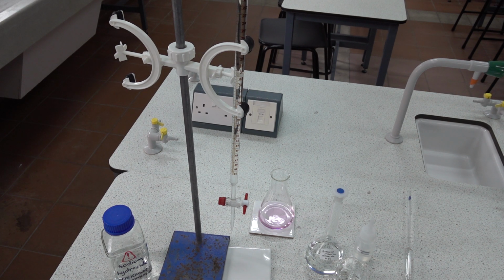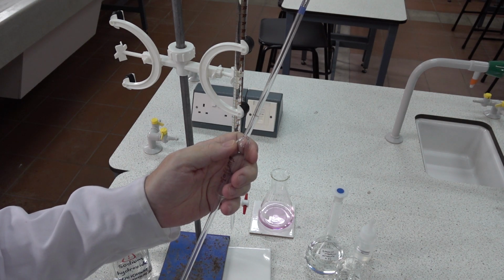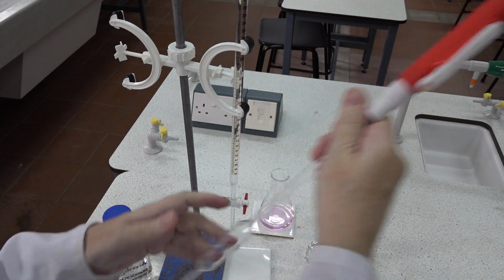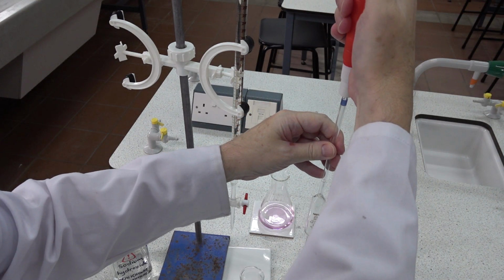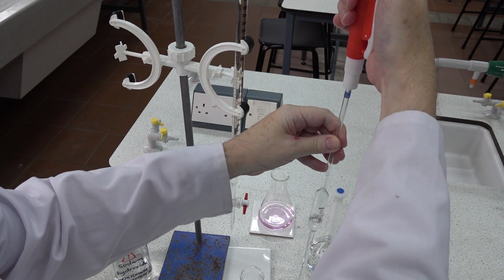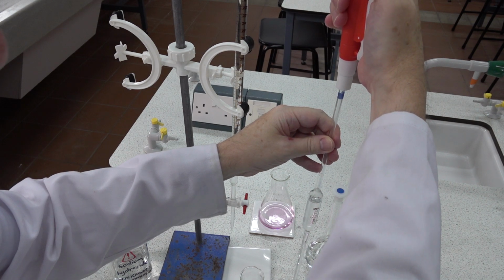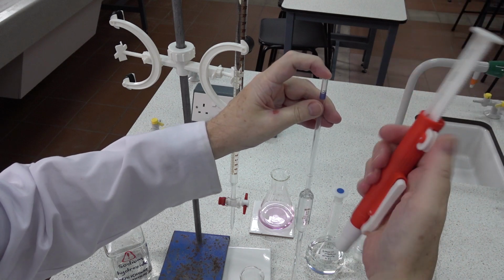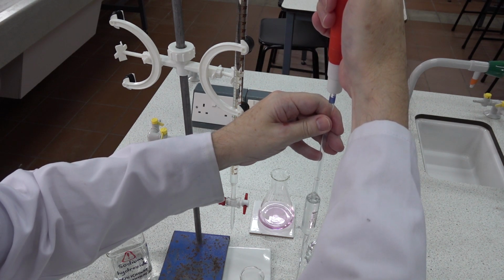The first thing to do then is to pipette 25 centimeters cubed of potassium hydrogen phthalate, the acid in this titration, into the conical flask. So to do so, we can use the pipette filler we've got here, draw up the solution, and one thing we can do with a pipette filler such as this, if we need to, is just remove it. We don't have to worry about the solution running out really quickly, and then just replace it onto the end and continue to draw up.